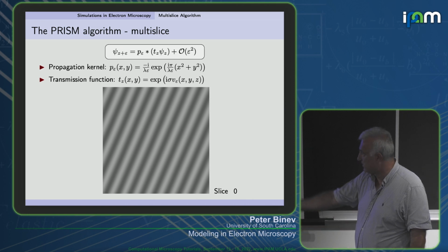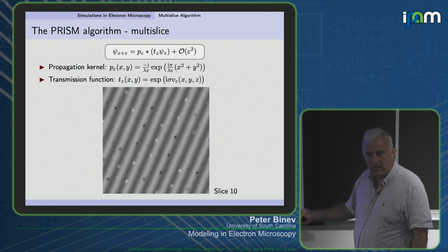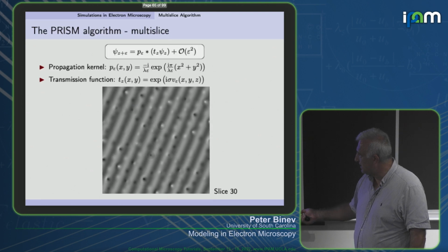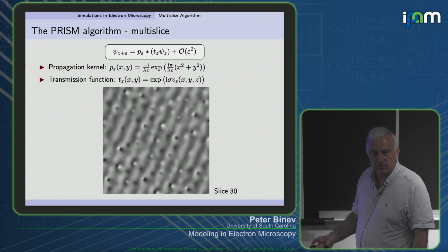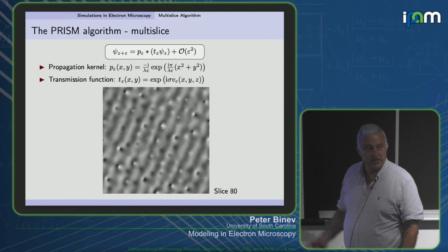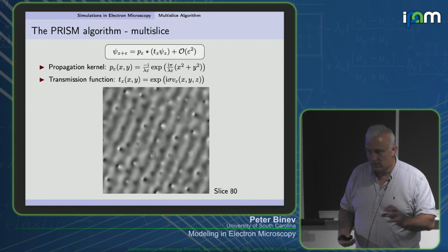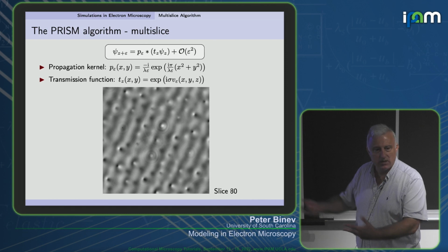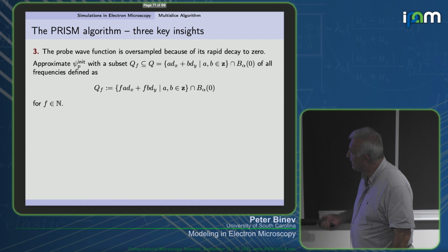This is one of the elementary waves. Then it progresses through the atoms of the sample, and we receive something which is global, and we have this exit wave. When this exit wave is calculated for all the elementary functions, we can make the linear combinations corresponding to our particular positions, and then can calculate what is going on.